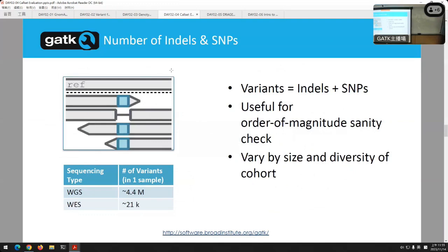Now, I should note as well, when you're comparing populations, sometimes you won't find a perfect match. You just won't find it. But what we often do is take subsets of our call sets and compare against subsets of another call set. That's completely valid. Often we'll use a subset of our call set as a proxy for the entire thing. I'll talk a little later about concordance. This is what my team does when we're doing our last stage of calling for ALU, for instance. They're literally generating those statistics. The team messaged me this morning with some of the initial ones. You compare a subset with others, you can get good initial numbers.